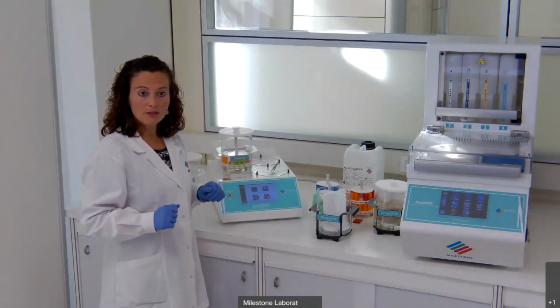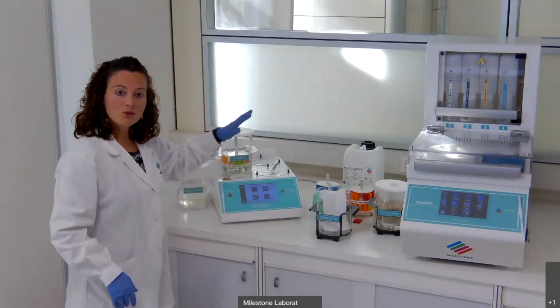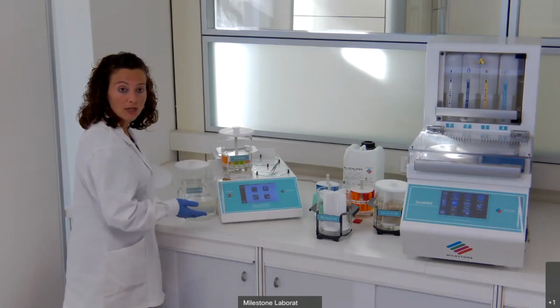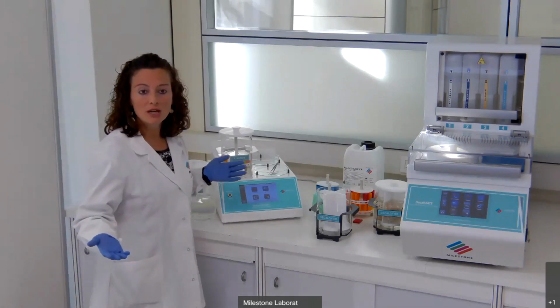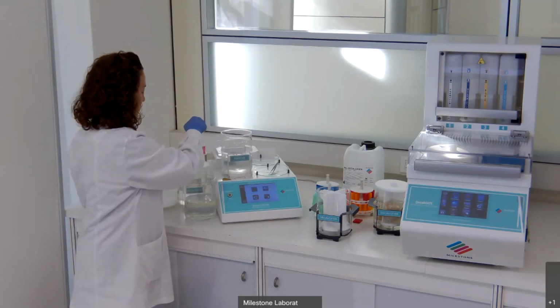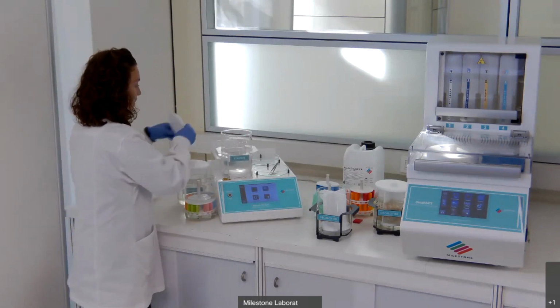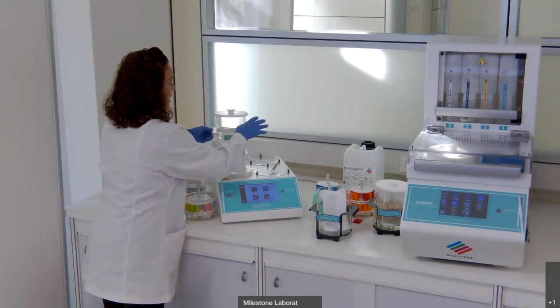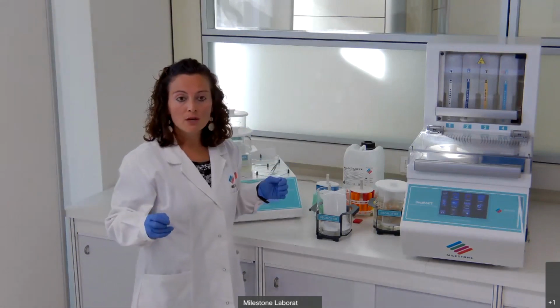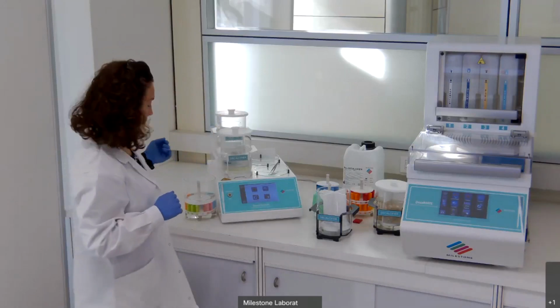Once the fixation is completed, we can move the rack into the decalcification solution. Between the fixative and the decalcifier, it's possible to perform a wash in a solution that is already in use in the lab. This solution can be, for example, water, ethanol 70, or any kind of solution that is already in use in the lab. For sure, the good positioning of the bone station is under a fume hood because you avoid being exposed to formalin and decalcifier vapors.